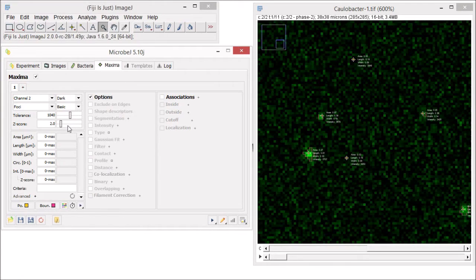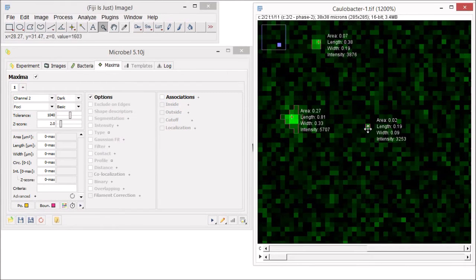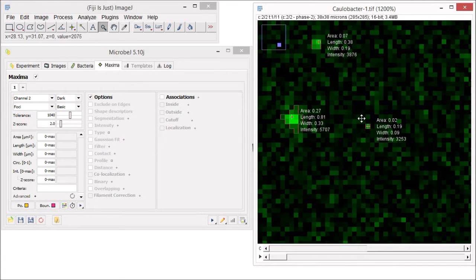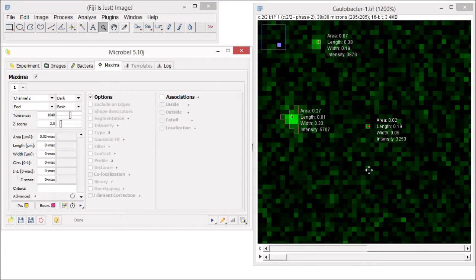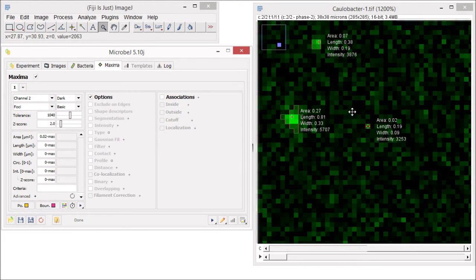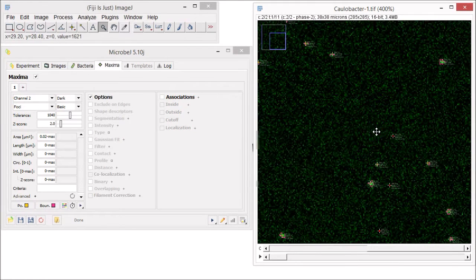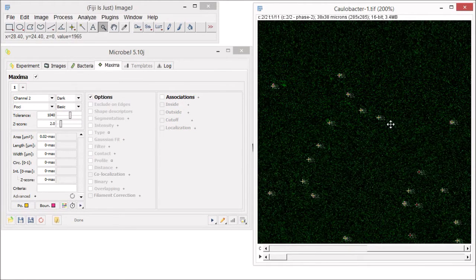Sometimes we will notice that not every maxima detected will be a foci. If you zoom in, you can see that similar to the bacteria, you have access to the specific attributes of the maxima, such as their area, width, or length, which can be used to filter out unwanted maxima. So if you want to exclude a maxima from the final analysis, just adjust the minimal area width to something greater than 0.02 and click on the test button again. The particle is turned red, meaning it is now rejected from the final analysis. Note that by optimizing the tolerance and the z-score, you can easily refine the rejection process by using those basic attributes until you find the right combination of values.